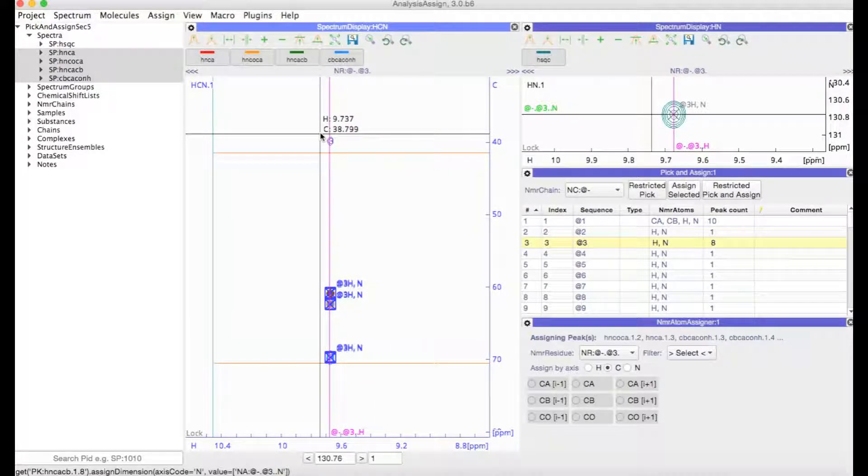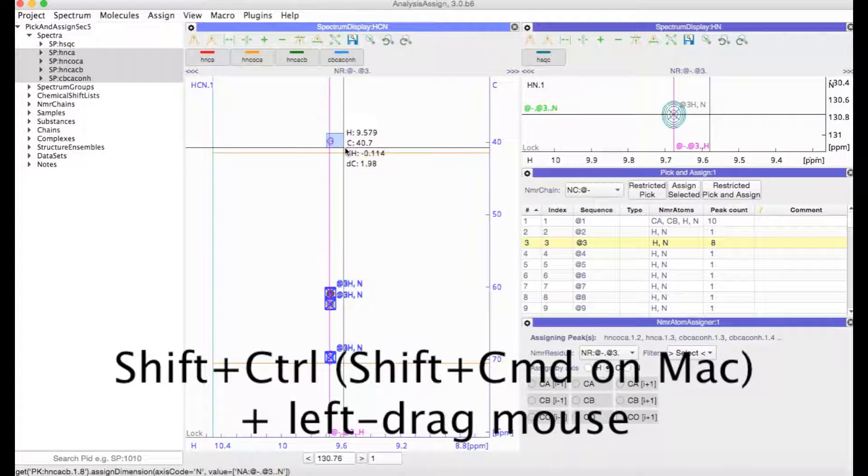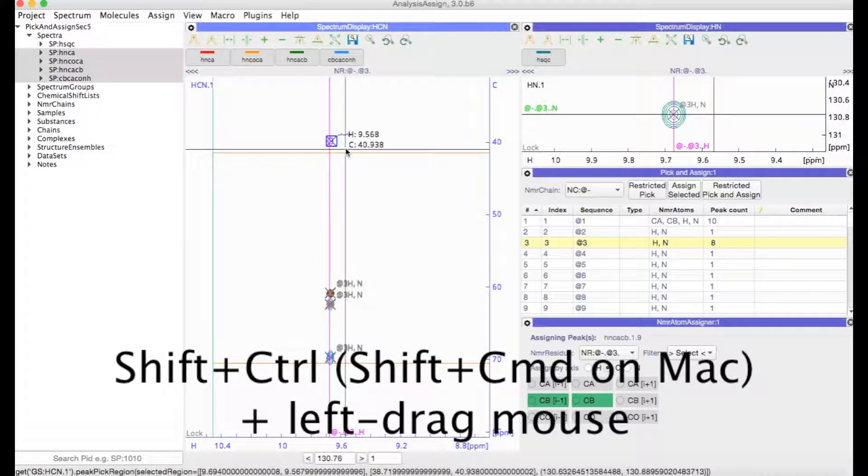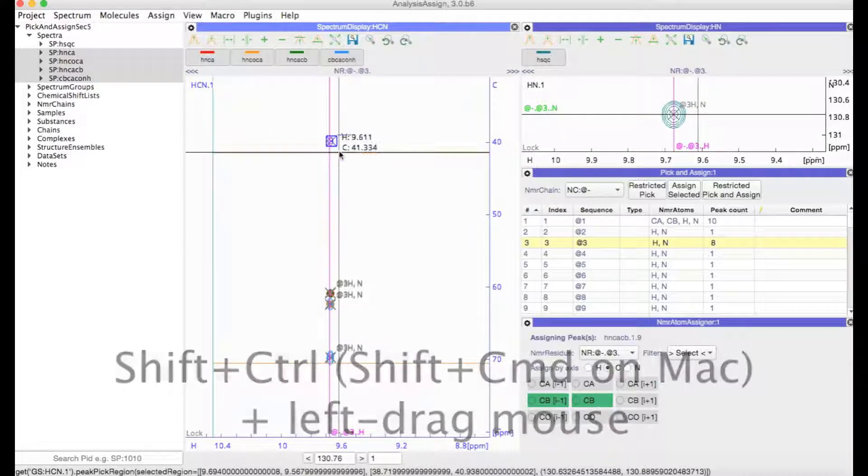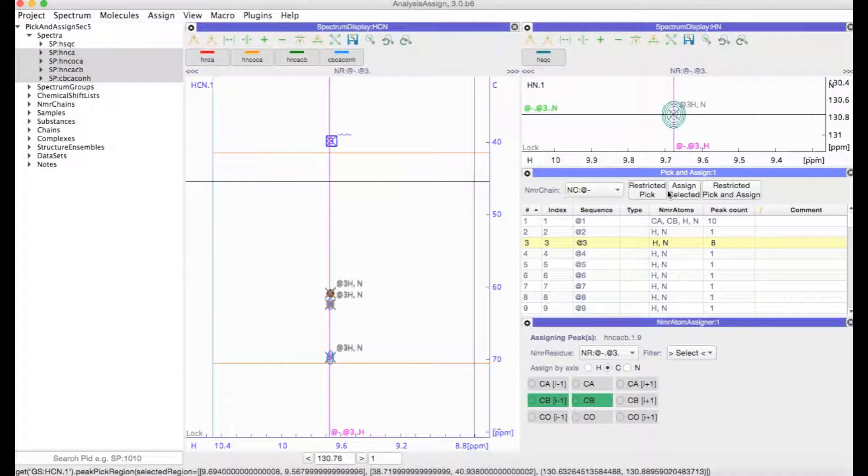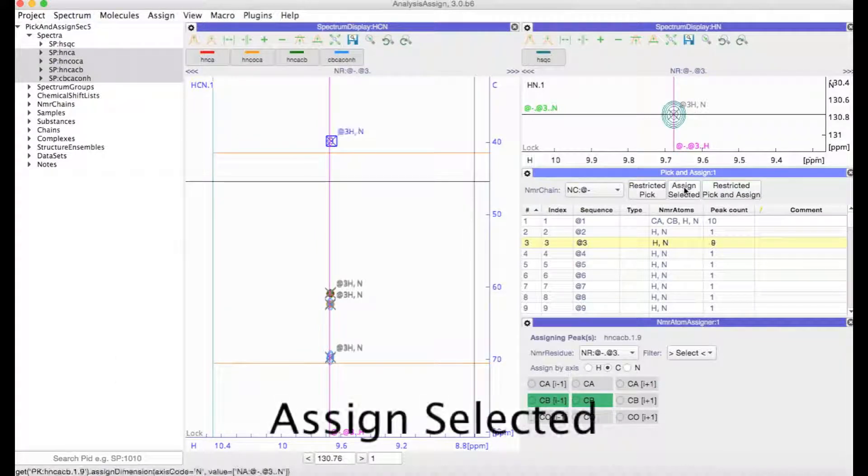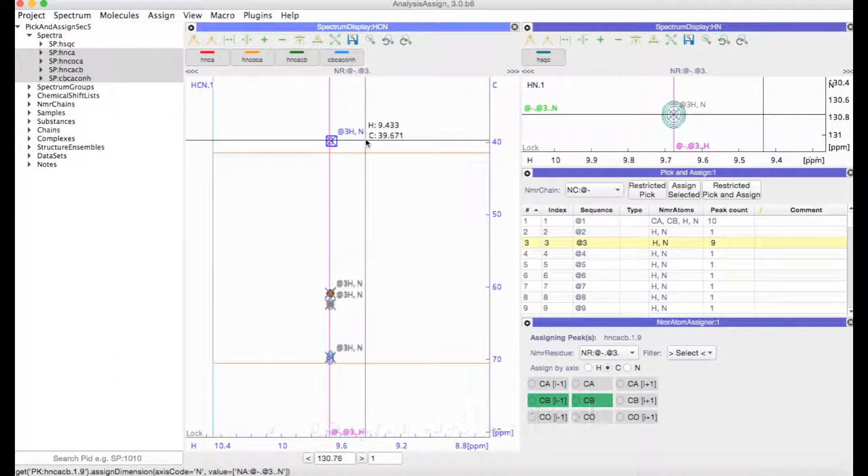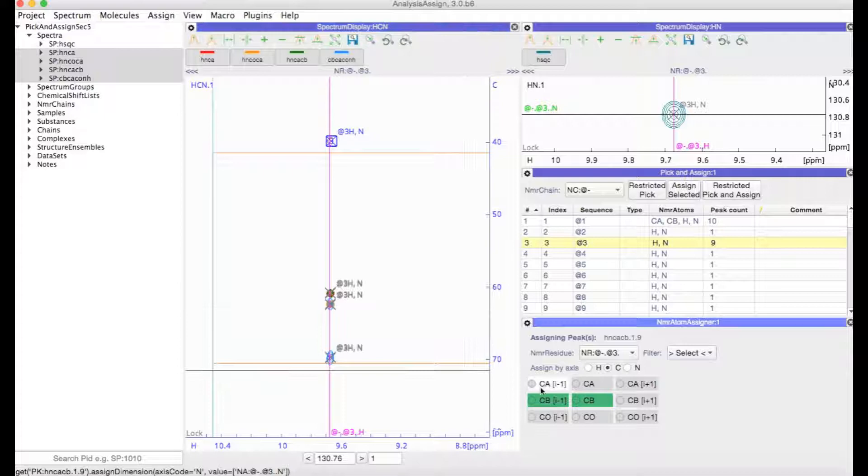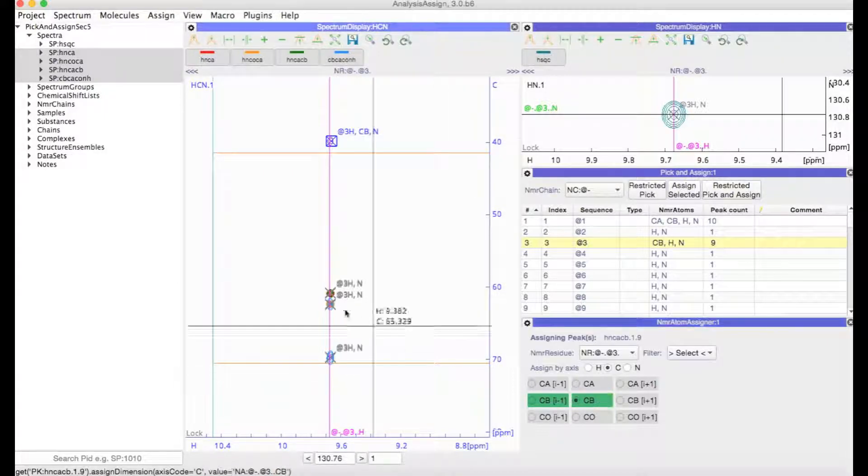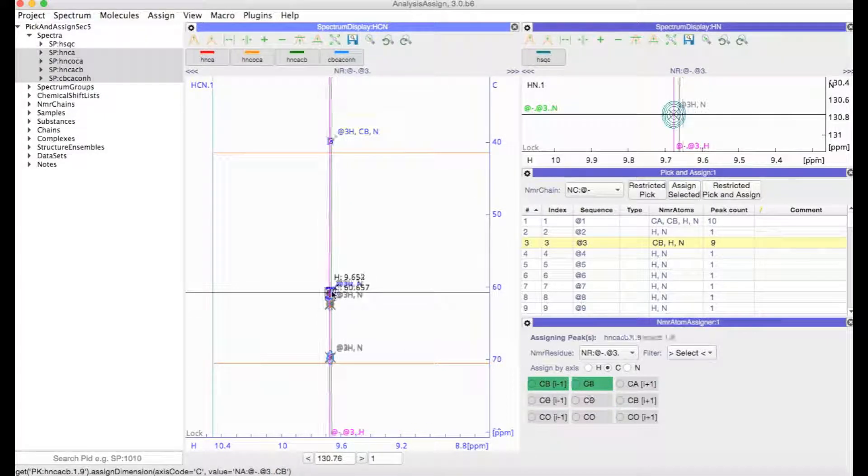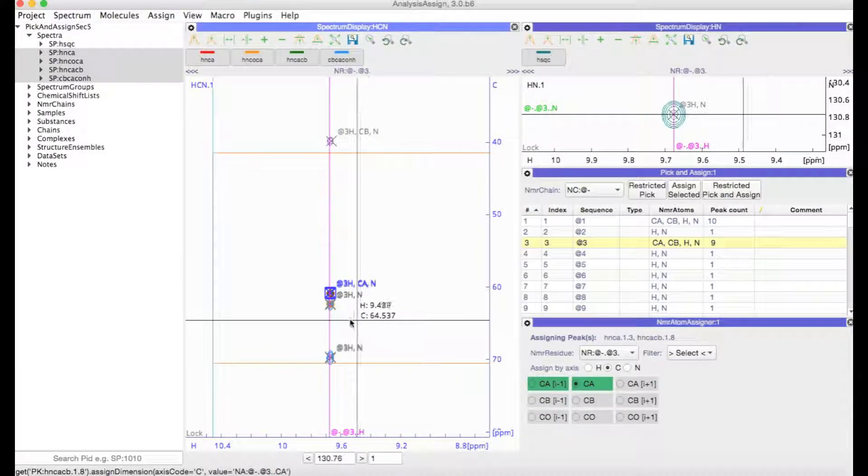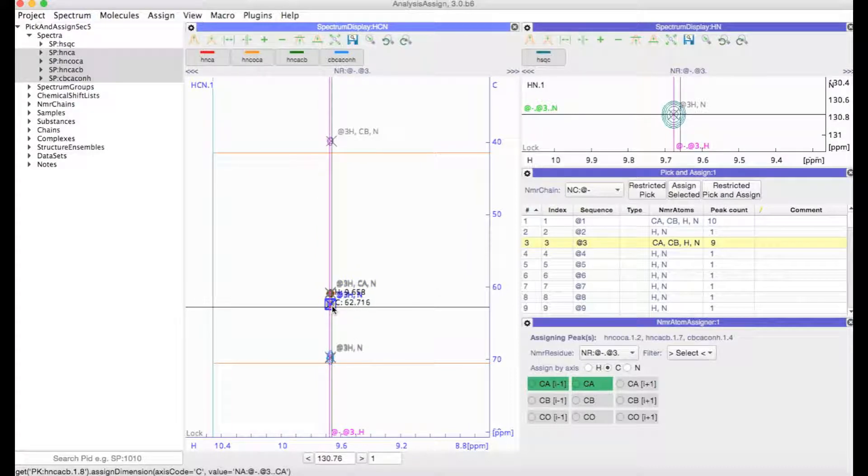So I can just pick it there by clicking on shift and control or on a Mac shift and command and then dragging the mouse. And then assign selected to assign the H and N atoms. And then in the normal way I can make my carbon assignments.